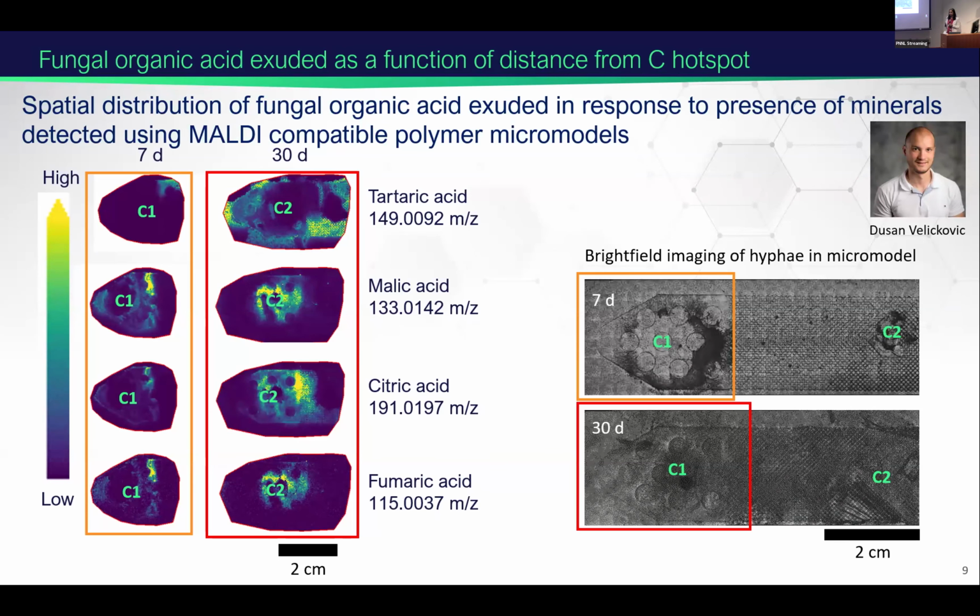For example, as the fungi was making different types of organic acid and uptaking potassium, we found that there were different types of potassium chemistries inside of the hyphae, and we were able to detect that at SSRL. So this is an example where we transferred these samples across different labs, and we developed this workflow where we are able to separate biomass from the habitat itself, to characterize the biomass that is growing inside of these habitats.